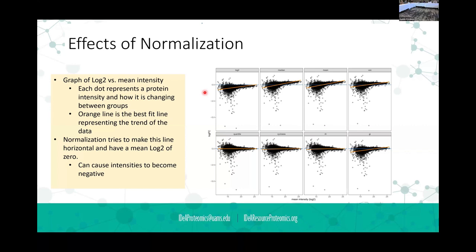For big proteomic data sets where you are doing a treatment, your assumption is that out of the thousands and thousands of proteins, whatever treatment you do, only a small subset are actually going to change. So the assumption is that most of the proteins are not going to change. The other assumption is that whatever cumulative change can basically be summed to 0: the amount upregulated and the amount downregulated.